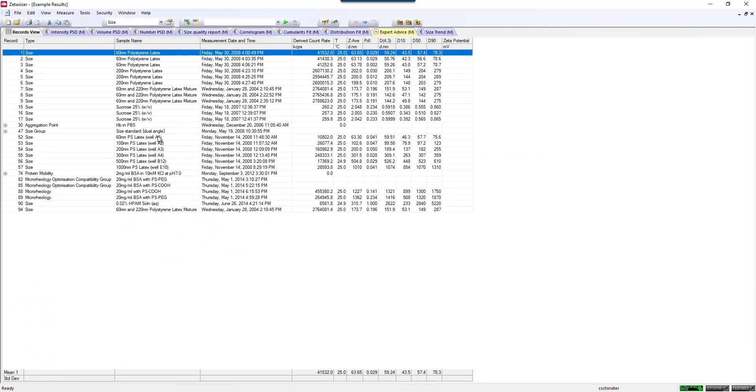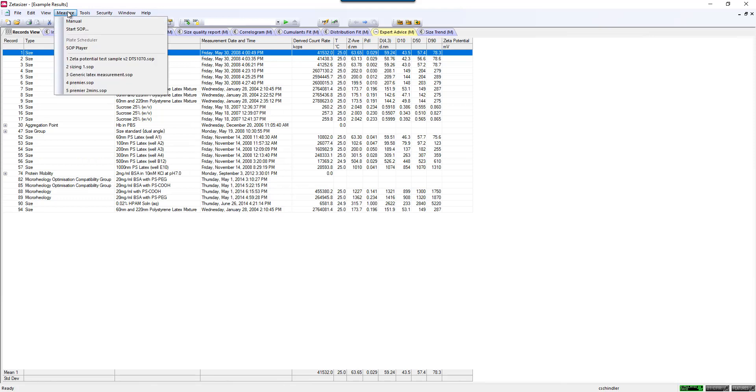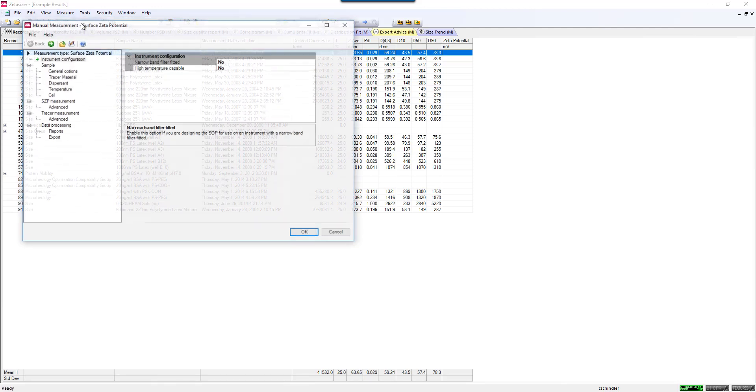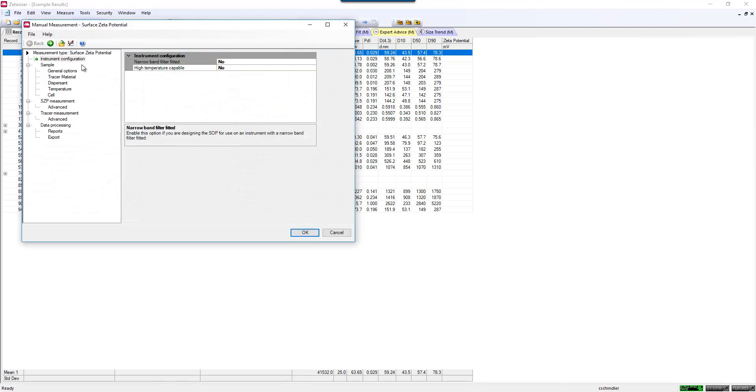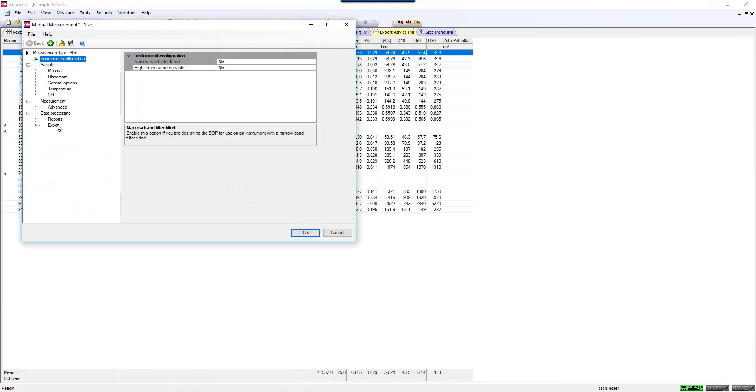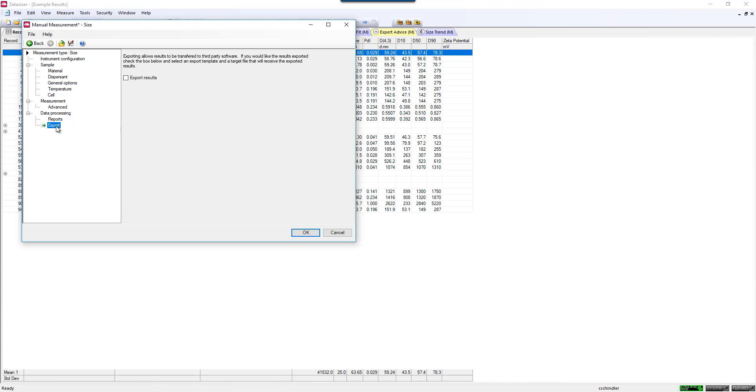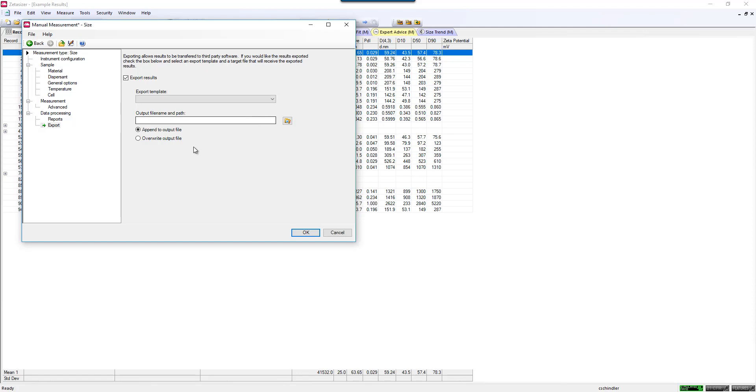The last way of exporting that I'll mention is you can do this actually automatically during a measurement. It can actually be part of your SOP. If you go to Manual SOP, and let's say we have this on a sizing measurement, you'll notice at the bottom there's this Export button. You can tell it to actually export the results automatically without you having to go through that extra step at the end, if you so choose.